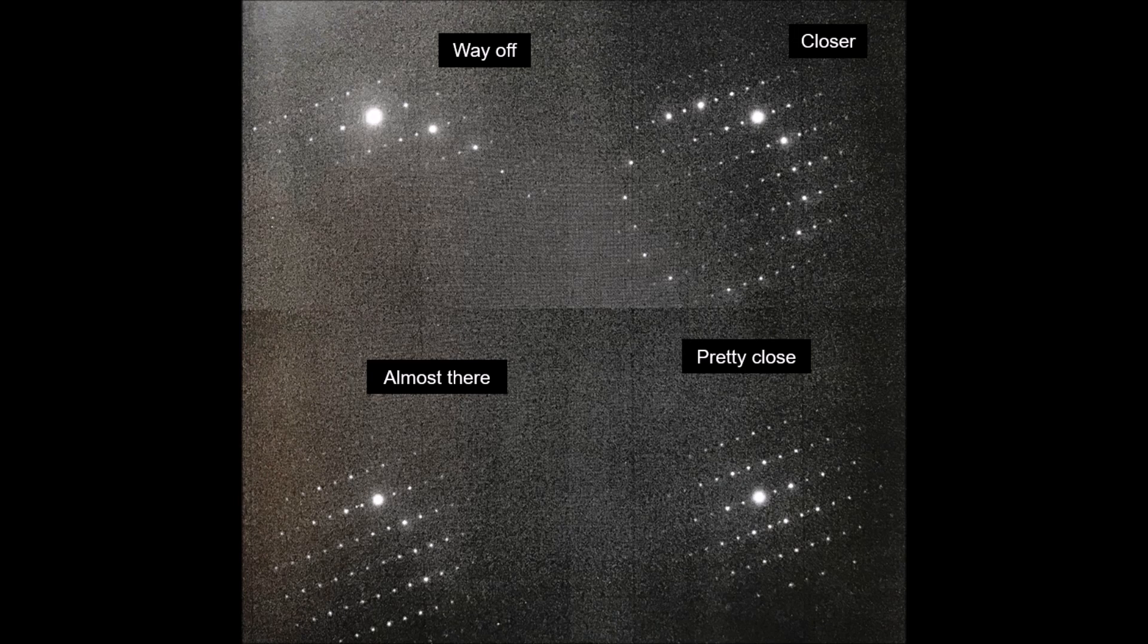And we can start to see what looks like a zone axis pattern forming, but I'm clearly not satisfying the criterion that every spot and its opposite is equal intensity. And if you look as I curve away to the right of the direct spot, you can kind of see those spots kind of fall off in a circle.